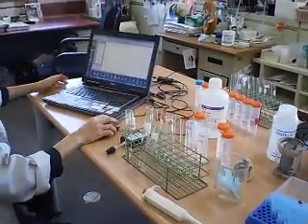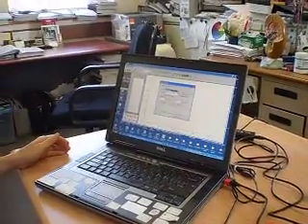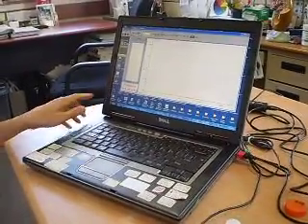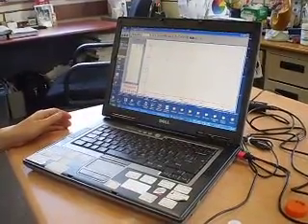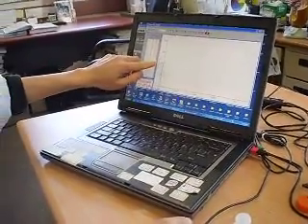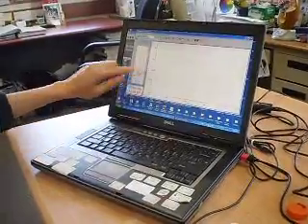Before I get into data collection, set the time base for the first 900 seconds. Click on done. So I have my pressure against time. The atmospheric pressure right now, I click on this green button here. Currently atmospheric pressure is at 101 kilopascals before the reaction starts. Once I start my reaction, I'm going to add my enzyme and pressure will build up. Oxygen gas will be released over time.